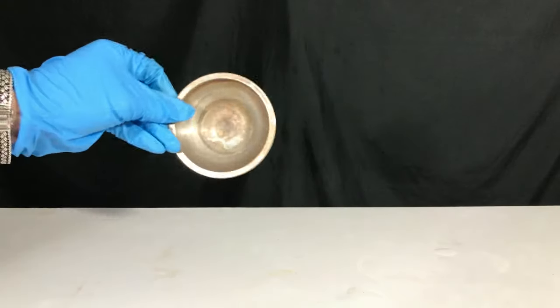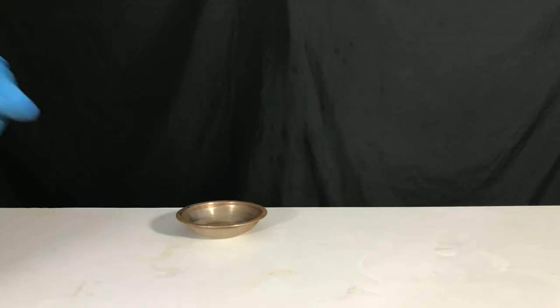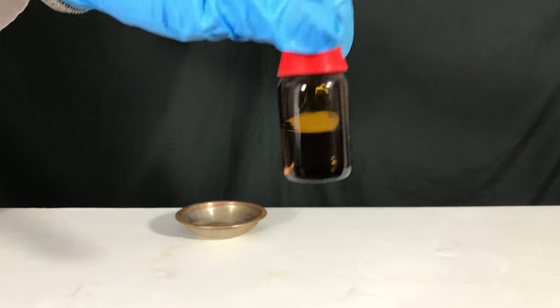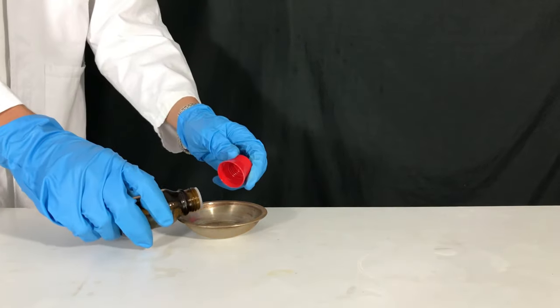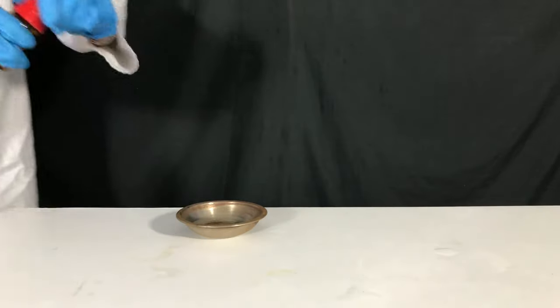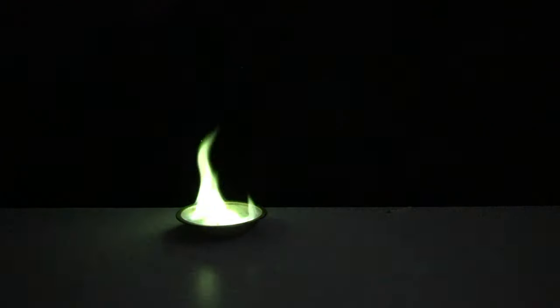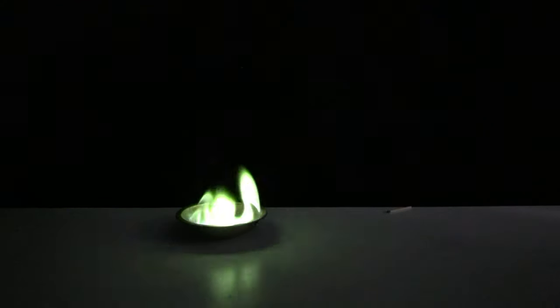And now for the fun part that you all waited for. Now we take a burning dish. We start off by taking some of the methanol tri-methyl borate that came over second. The lights are turned off and we light it up. A nice green flame can be observed.